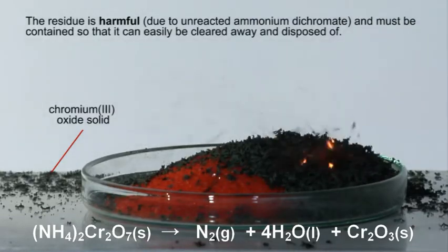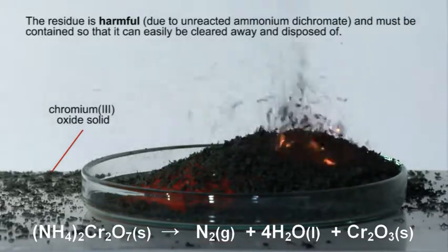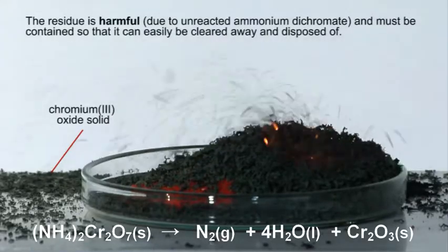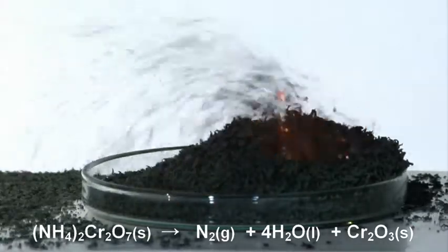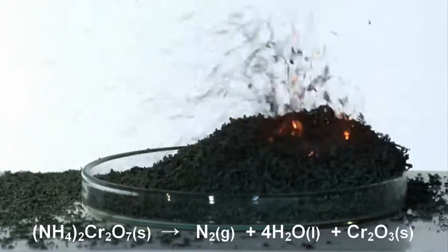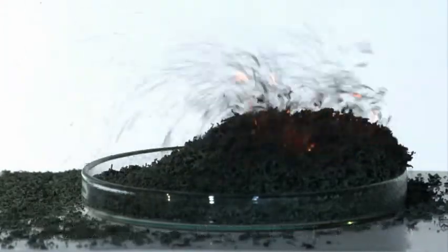The dichromate ions are strongly oxidising. They react with ammonium ions, oxidising them to nitrogen gas and water, the dichromate being reduced to chromium-3 oxide.